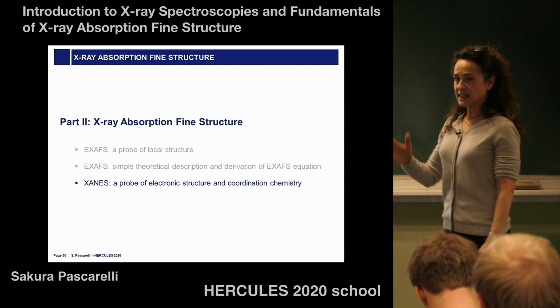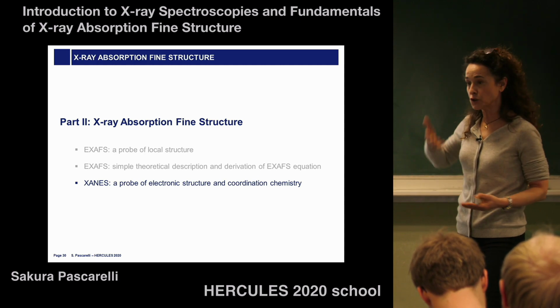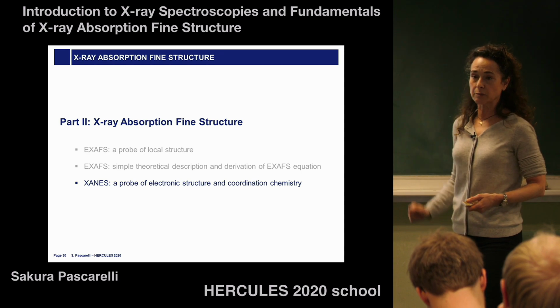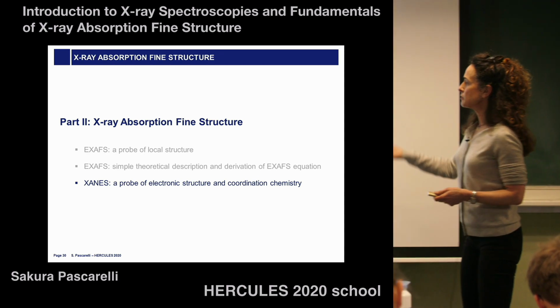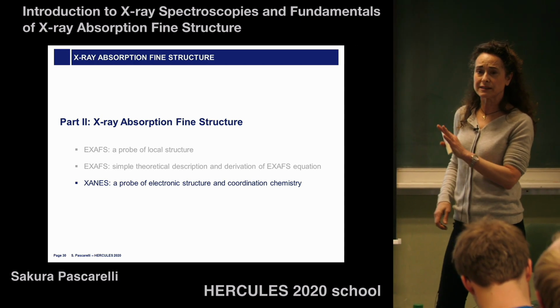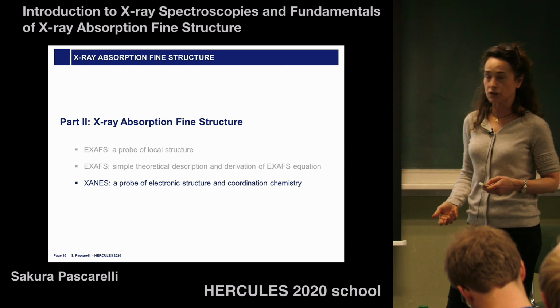The problem is, as I said, that it's not so simple to analyze because this photoelectron just lives forever. And so you would have to put a sum over 1,000 paths to explain all those features, and we can't. I'm going to show you some examples to just give you a feeling of the kind of information that you can get.